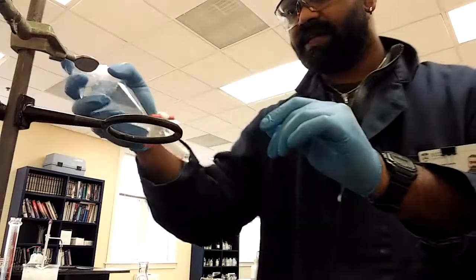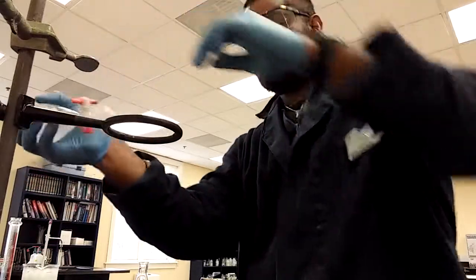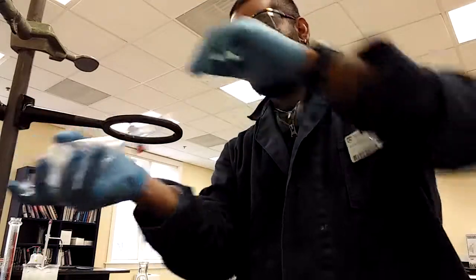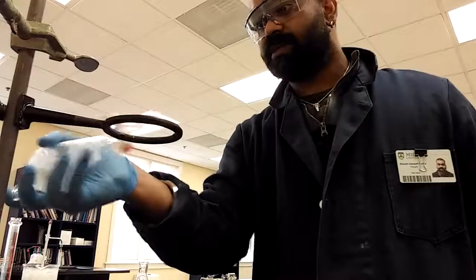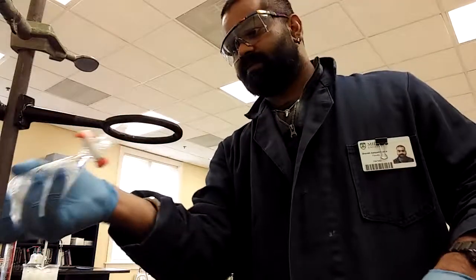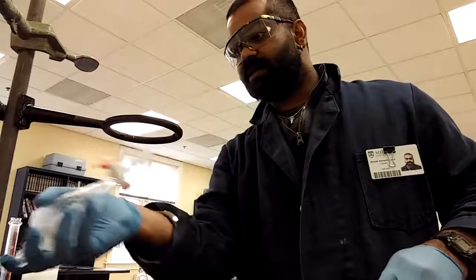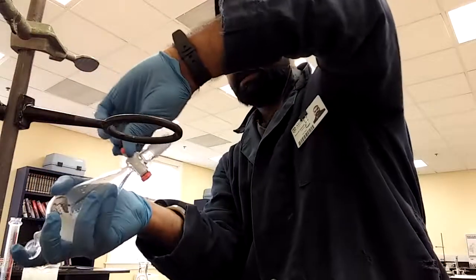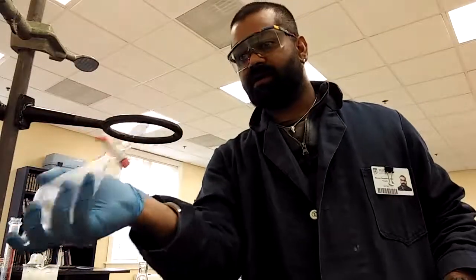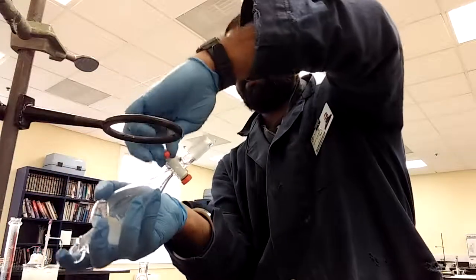I must have a leak in my... Ooh, you see that? You have to vent frequently. Don't shake for 5 minutes and then vent. It's probably going to explode by then. And I'm doing it completely in this direction because I think my valve is slightly leaking, so I don't want to lose any more of the reactant mixture. So I'm just shaking. See, I'm frequently venting.